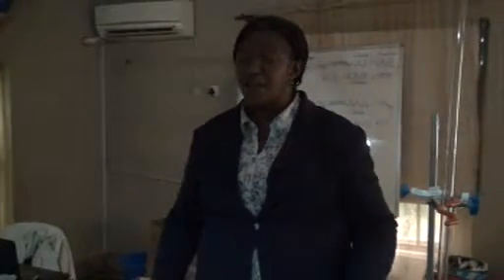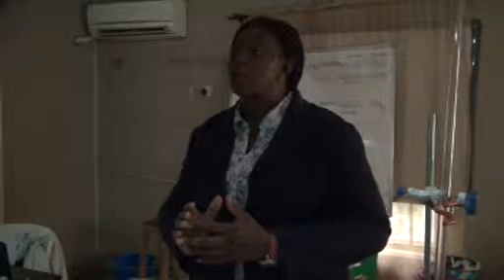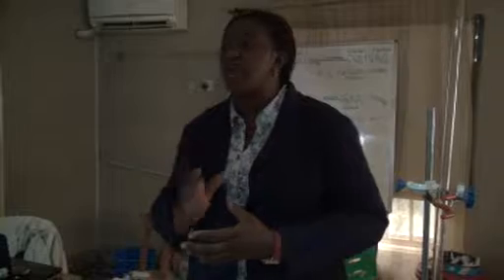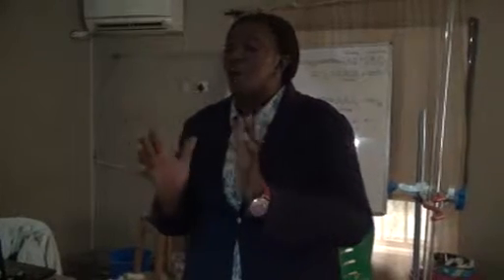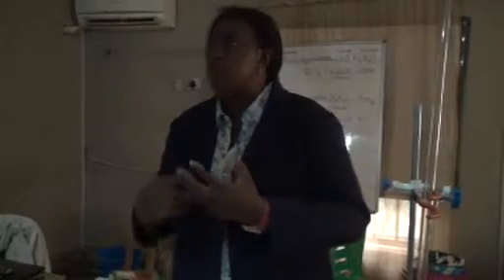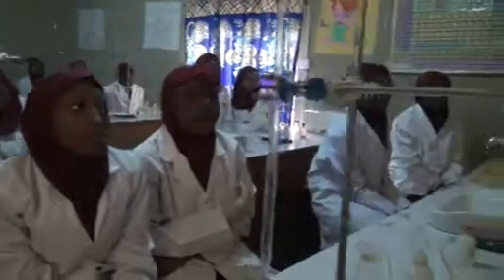Now in this titration, there are rules to be followed. You are expected to stick to the rules, the precautions before the titration, after the titration. After taking all safety rules, like wearing your lab coat and your hand gloves, the next thing is that when you start this titration, you rinse your burette with the acid to avoid dilution, because you have already rinsed it with water. You rinse your pipette with the base to avoid dilution, because you have already rinsed it with water.